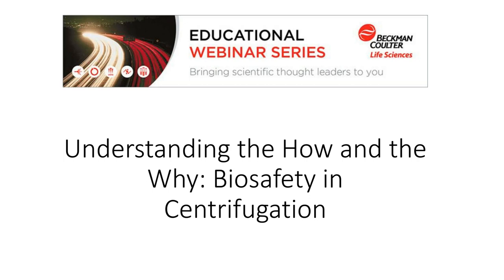And I believe one of the poll questions had to do with our inspecting centrifuges and rotors. This is what we do during an inspection, is we literally look down into every well or into every bucket. And we're doing this with magnified telescopes that are well lit to be able to look at the microcracks that might be created over time, that are telltale signs that this rotor is starting to literally come apart. So it's really a combination of age, cycles and condition, and from that we make a recommendation.